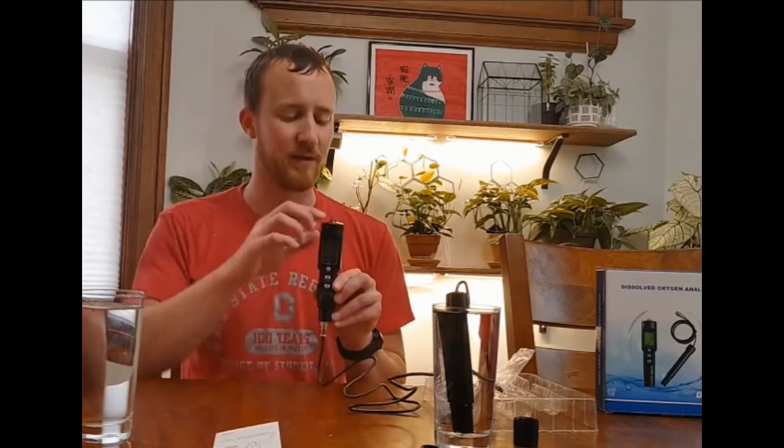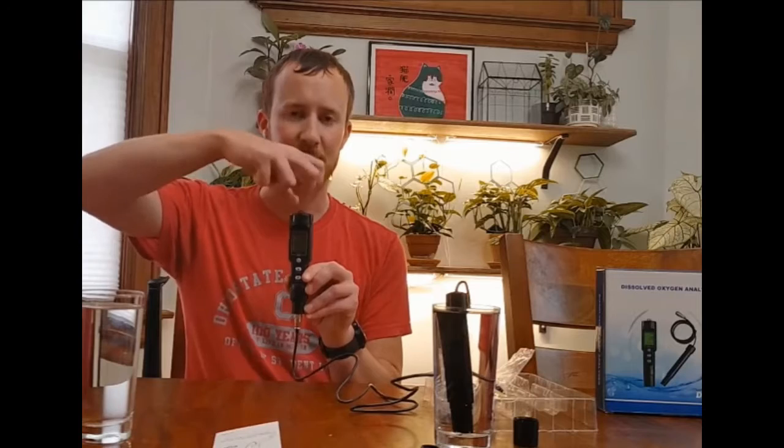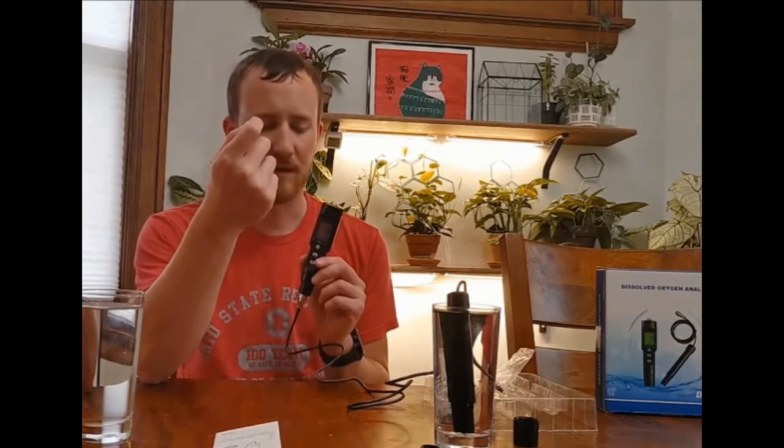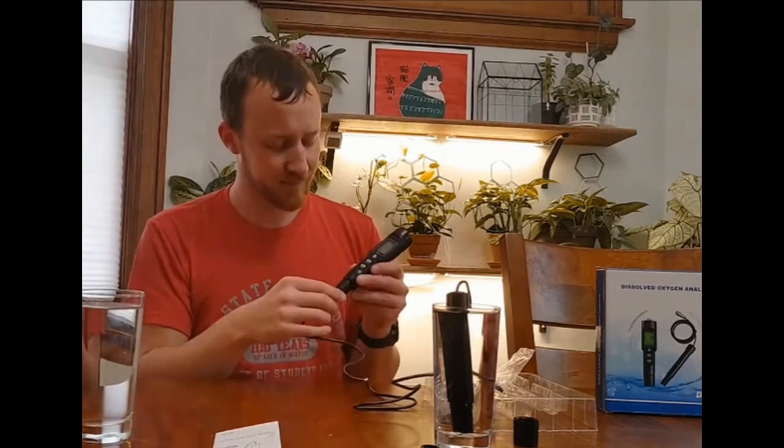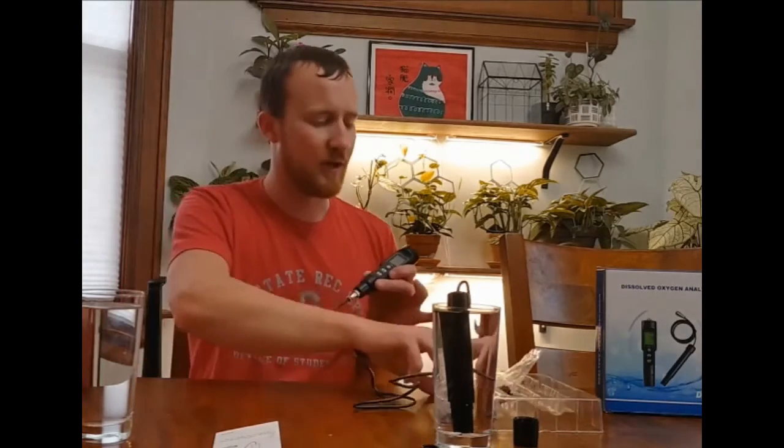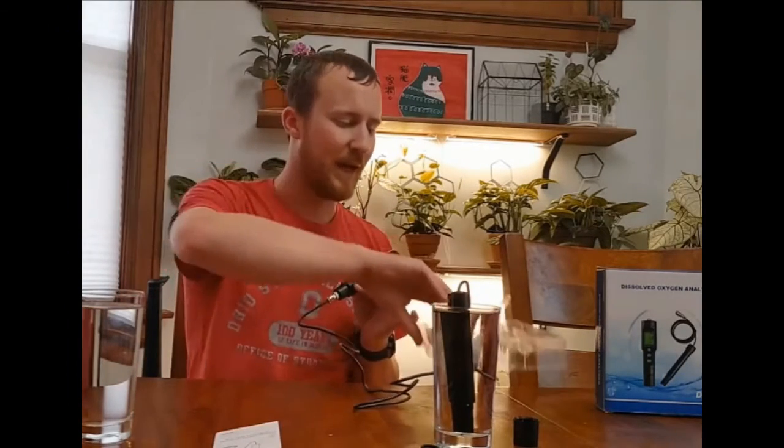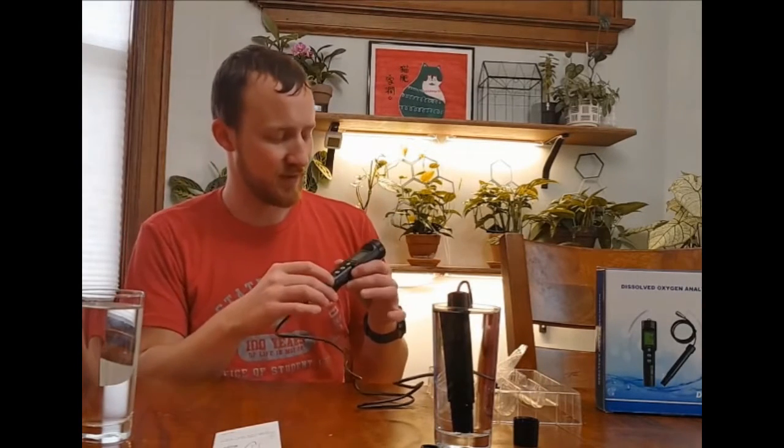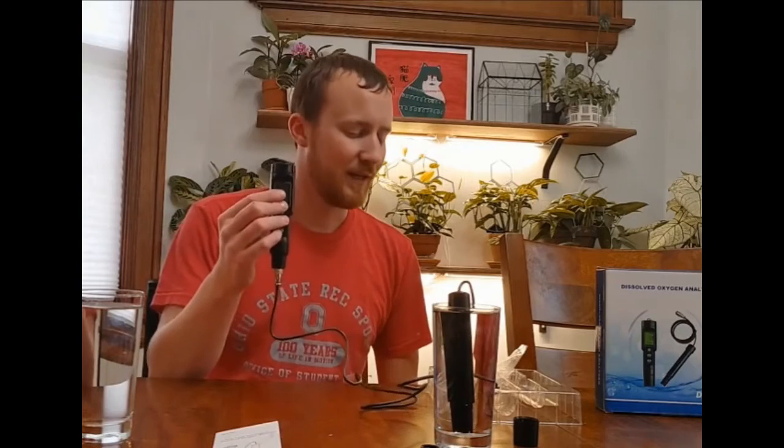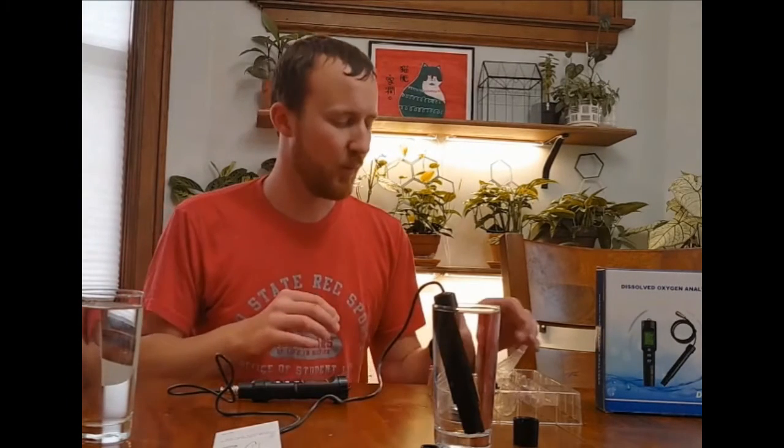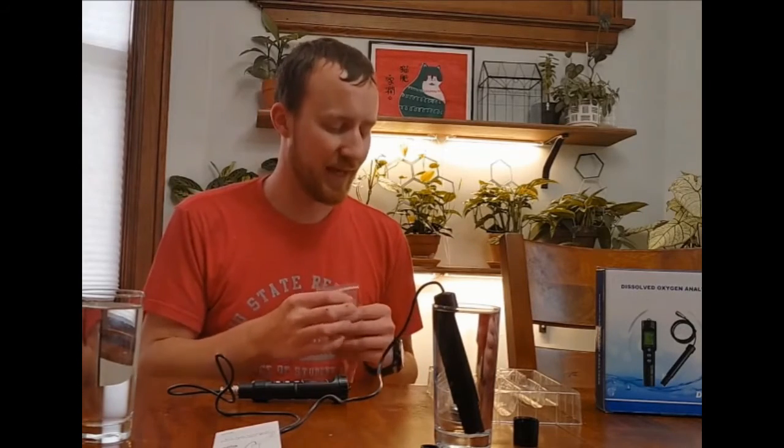There are batteries included. They are stored in this top case, and I'm not going to take that out, but it takes three little watch batteries. They're the thicker pen-type watch batteries, and this just slides on. It comes in a bubble wrap package and this just slides on and clips into place.